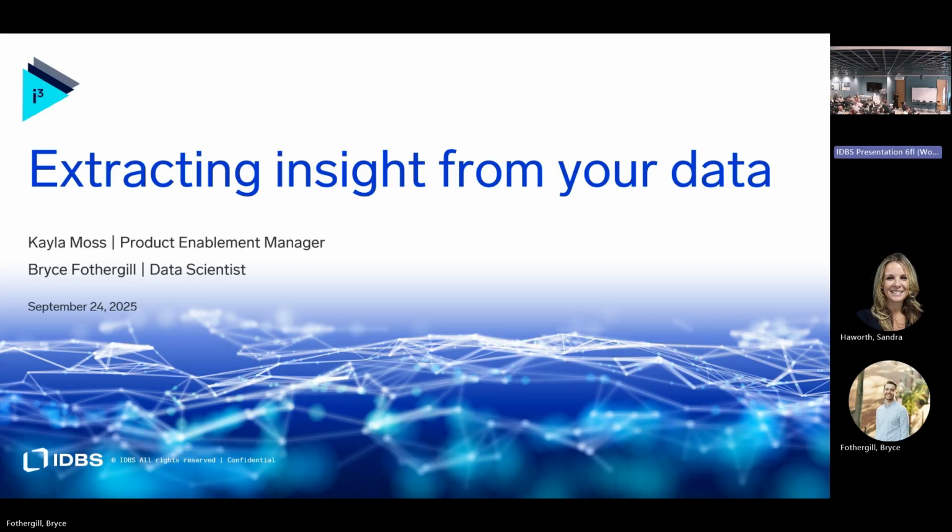And today we are going to talk about extracting insight from your data. So we're going to give you a demo of the Unicorn integration via an OPC connector. So you'll be able to see data flowing from Unicorn itself into the spreadsheet via the data backbone, and then coming out into Polar Insight, our analytics tool.